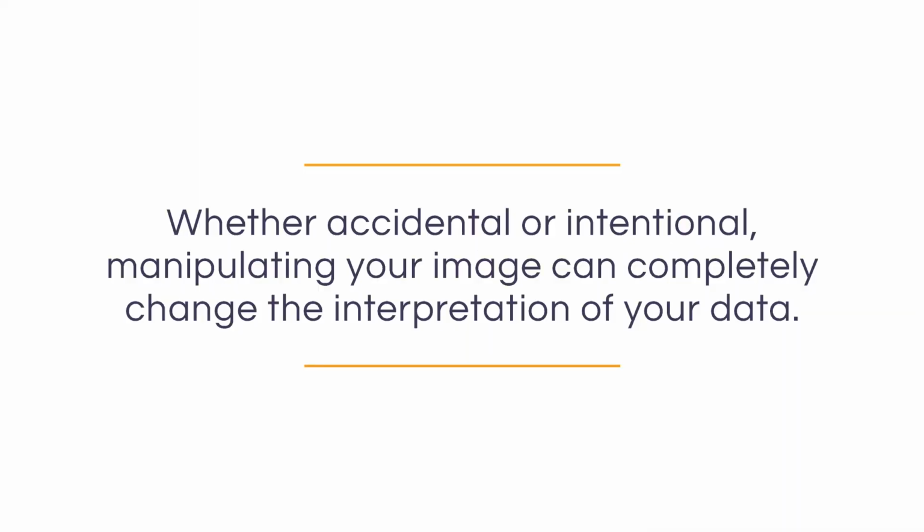Whether accidental or intentional, manipulating your image can completely change the interpretation of your data. Therefore, it's really important to understand how the software handles your data and which features can manipulate your data. So next, we're going to discuss the best practices for storing your membrane after you've acquired the image and analyzed it.